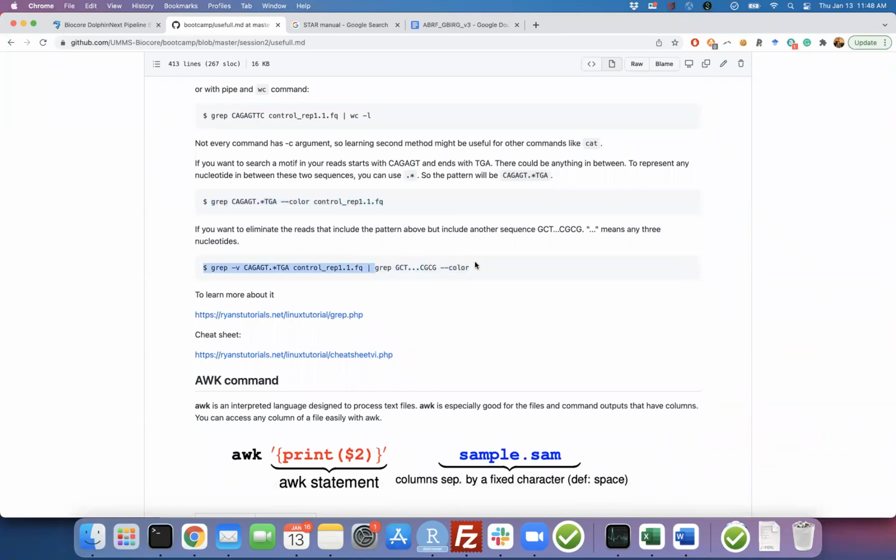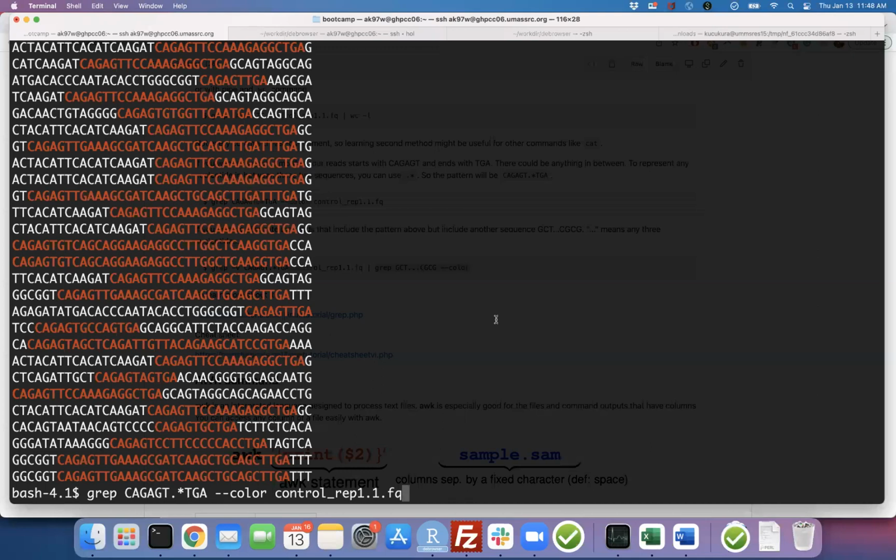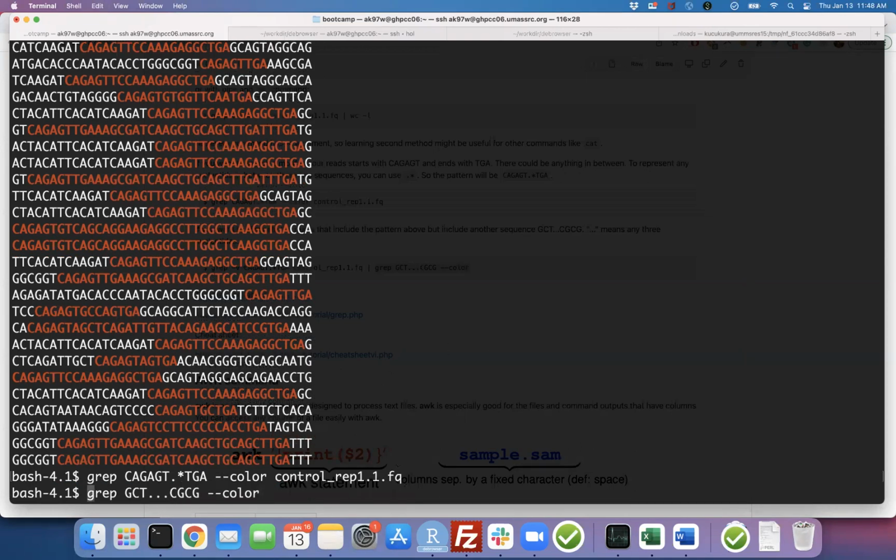This will allow not many, like star means the length could be anything. But when you use it like this, it requires only 3 nucleotides, because sometimes you put, like, 21 nucleotides in between these two adapters because you design these oligos. In that case, there are other options that you can define, like 21.